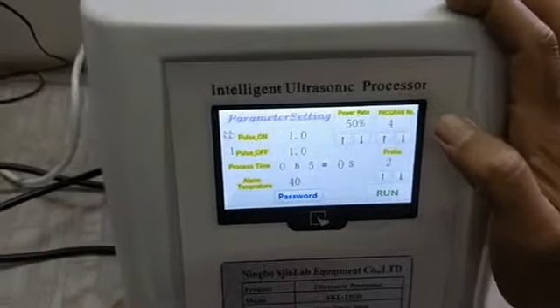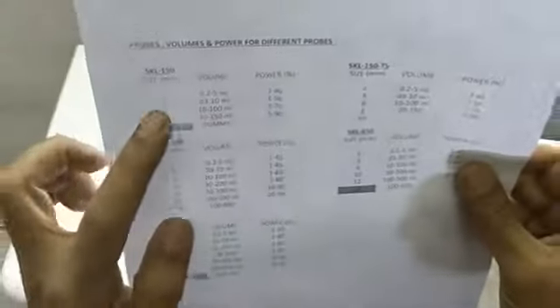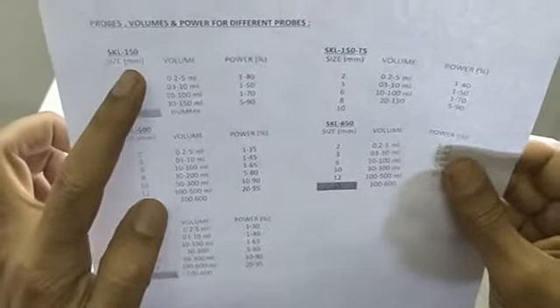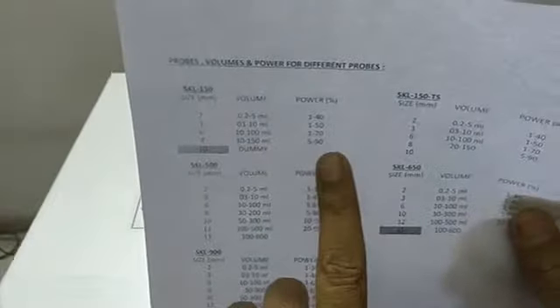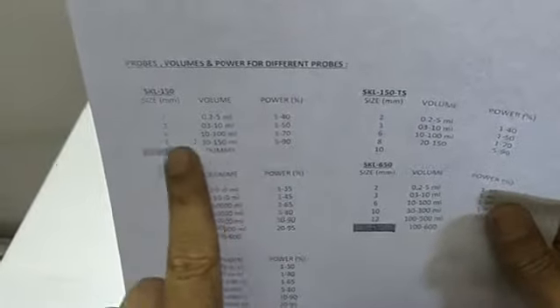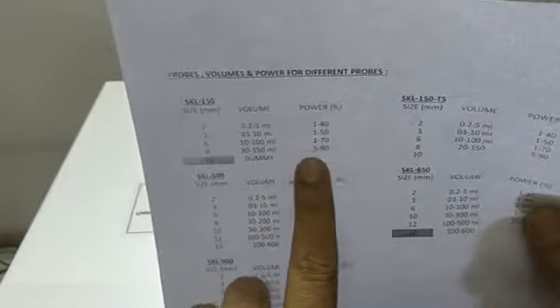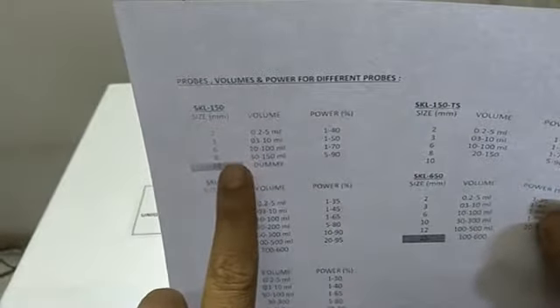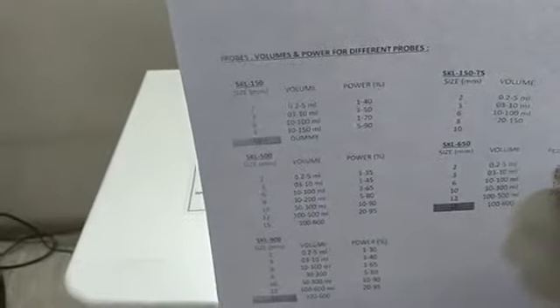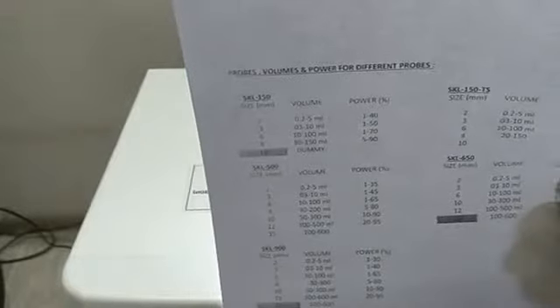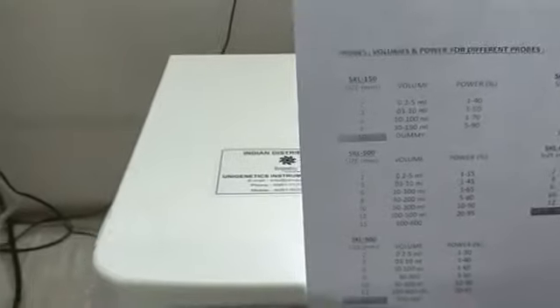Now, power rate. One more very important thing is this chart. As you can see for SKL 150, if you are using a probe of 2mm dia, the maximum power can be given 40%. For 3mm, maximum is 50%. For 6mm, maximum is 70%. And these are the volumes: 0.2 to 5, 3 to 10, and 10 to 100ml. This is very important. Make sure you do not give higher power. We are using 2mm dia probe, so we will not give more than 40% power.